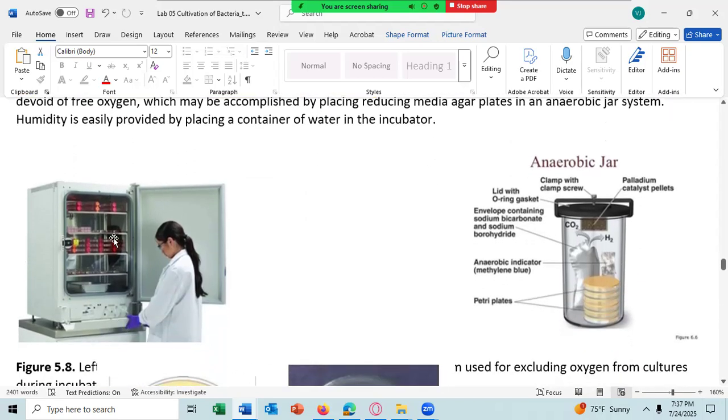You have to shut the door, obviously, to get the oxygen and carbon dioxide levels correct. And you have to shut the door to get the humidity correct, as well as, I guess, the temperature, but at least temperature won't change that much. Most of the incubators we have at Clark College only control temperature, humidity, and the time you grow the cells for. We don't have complex ones that control the oxygen and the carbon dioxide.